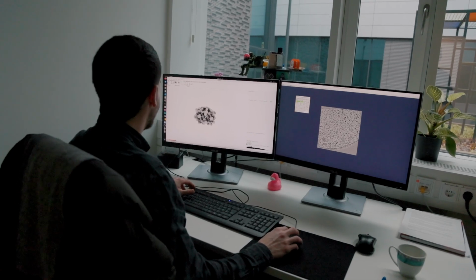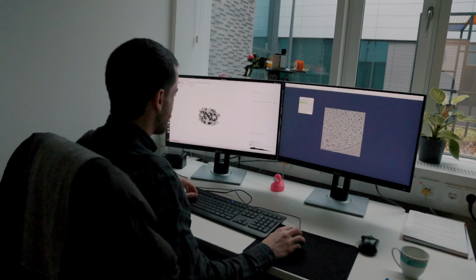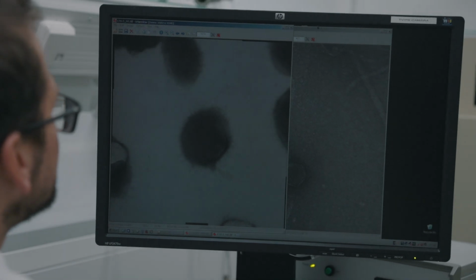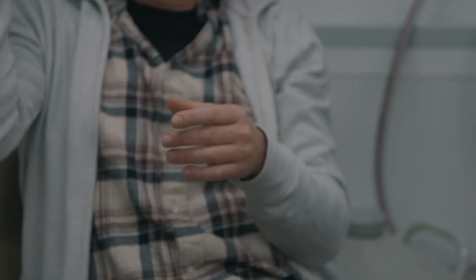One of the key differences, if you're interested in looking at protein structure, would be that you may preserve certain interactions that you may lose when you break the cells and isolate the proteins. So it gives you all that cellular context, which is really, really valuable. So what we try to do is to describe how the proteins that are performing the functions that we are interested in organize themselves inside the cell, how those whole metabolic pathways are compartmentalized or how they communicate and what else they may be interacting with. So we describe the architecture of the key biological functions that we're interested in directly within the cellular environment.